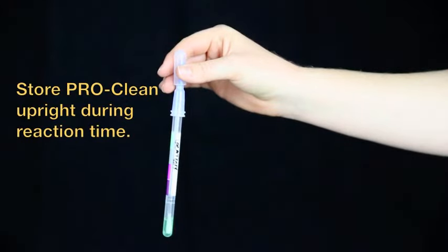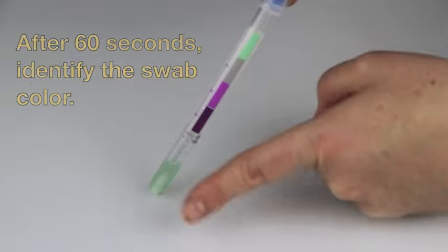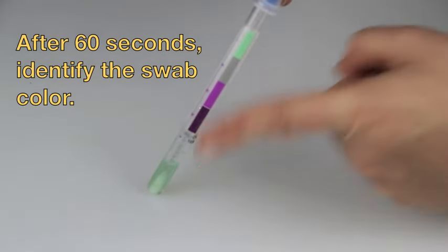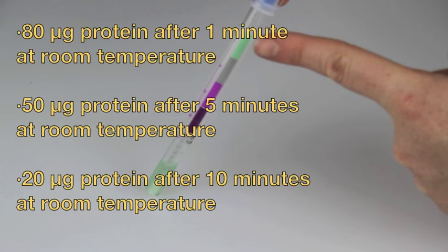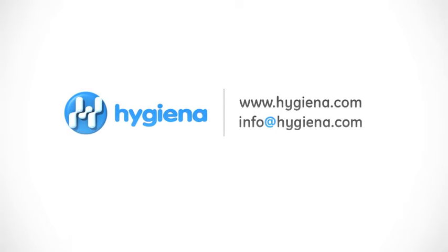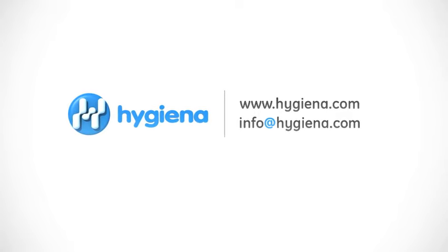Store ProClean upright during the reaction time. When time is complete, compare the color of the liquid against the color chart on the ProClean label. For additional information about ProClean or any other Hygiena product, contact us with the information on the screen.